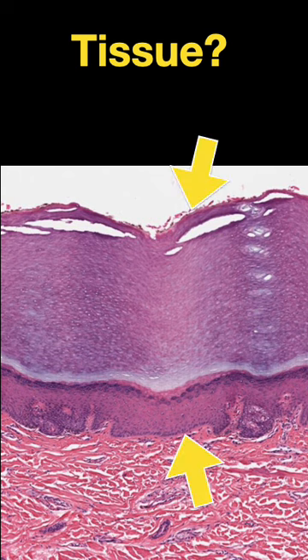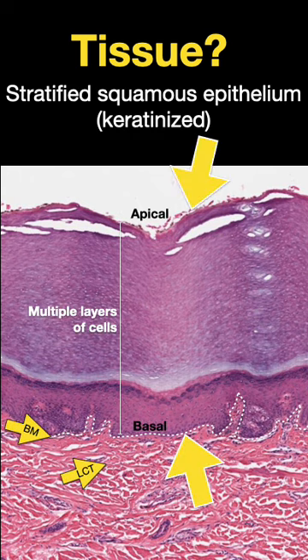What tissue is shown here? That's stratified squamous epithelium that is keratinized. You can see multiple layers of flat cells.